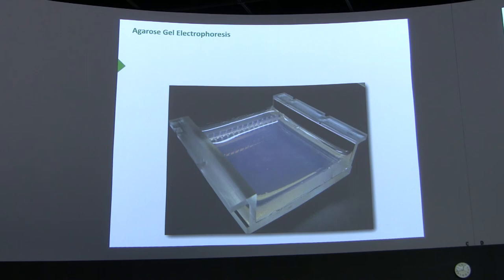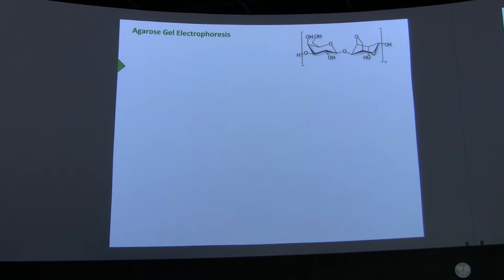There's a couple of kinds of material that are used for gels. The first I'm going to describe is that of agarose, which is one of the most common ones you likely would have run. And agarose provides a support. That support is what I like to think of as a sort of a mesh through which the buffer is embedded. Okay? So this shows the repeating unit of agarose support. And agarose is basically a polymer of a carbohydrate that actually comes from seaweed.